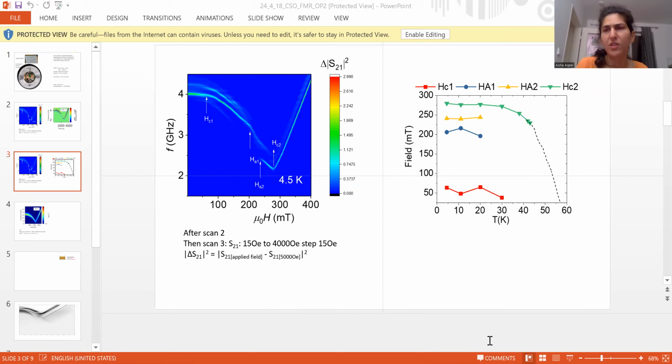So you can already start putting your collaborators, everyone who has worked on the same project, and name it something. And then what's important is that usually you try to put motivations in the PowerPoint, and then the idea is that you can clear your thoughts day by day. You can think better and you can modify it. And then you can start putting sample pictures, and then you can really think whether it's good or not.